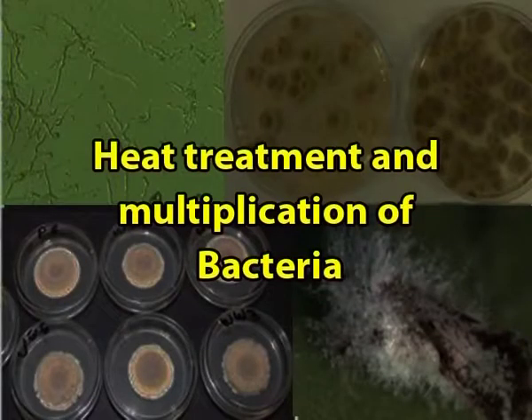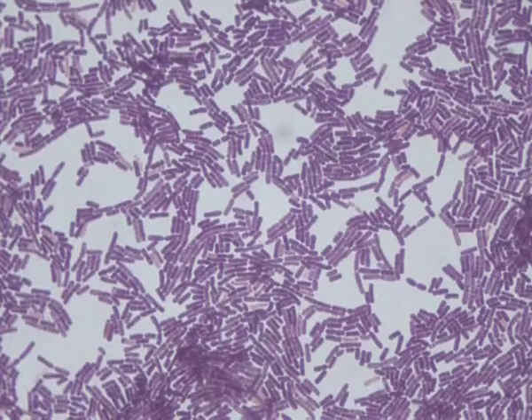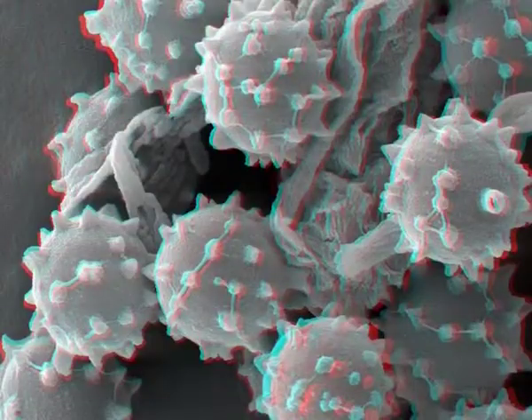Let us know about heat treatment and multiplication of bacteria. Heat the samples in a water bath at 80 degrees centigrade for 10 minutes and then chill tubes rapidly on ice. This step kills most vegetative cells of bacilli and non-spore forming bacteria, thereby enriching for spores of Bacillus species due to their heat resistant nature.